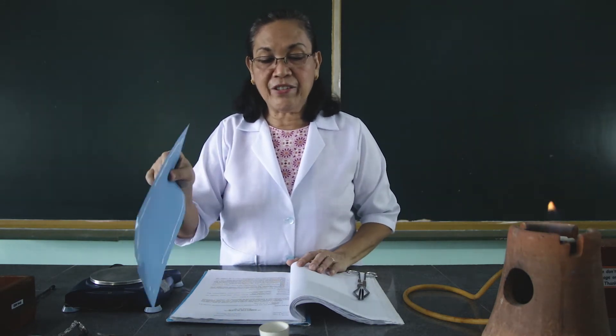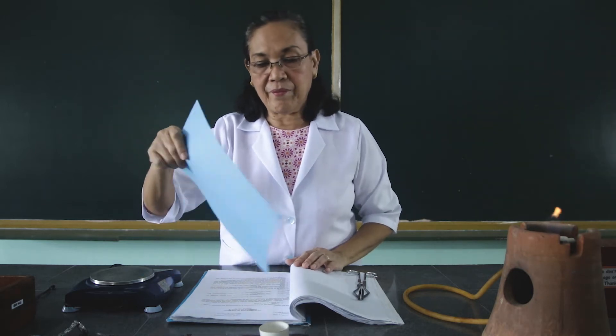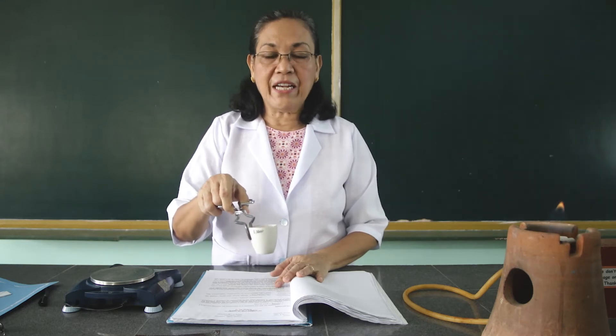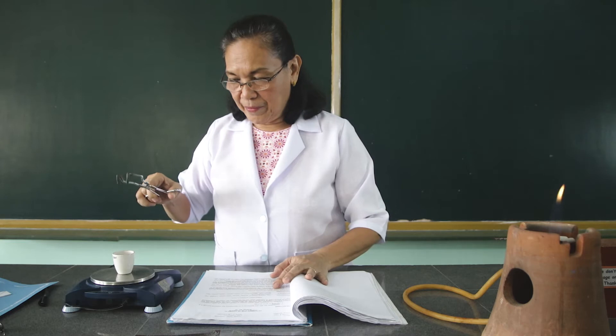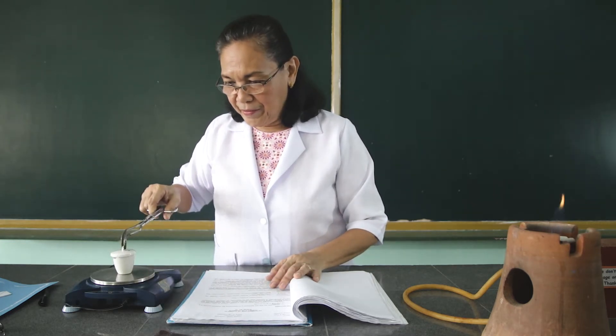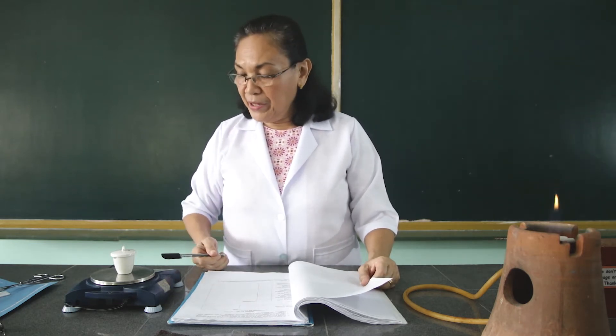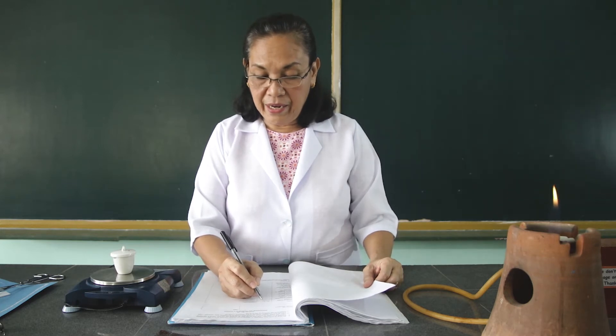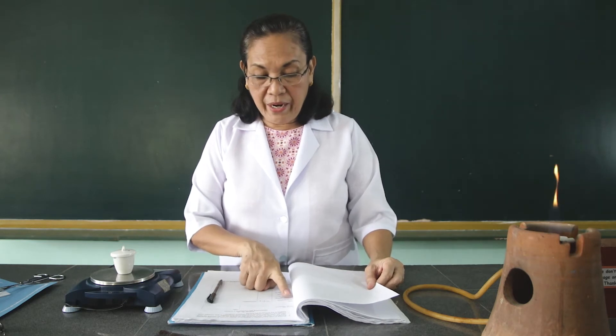We are going to remove this from the flame and cool it down. One way of cooling it is by fanning. We have already cooled down the crucible and we will get the mass of this empty crucible including the cover. Kindly record this — the mass of the crucible is 33.83 grams. Write this down in your data table in the space marked 'mass of empty crucible.'